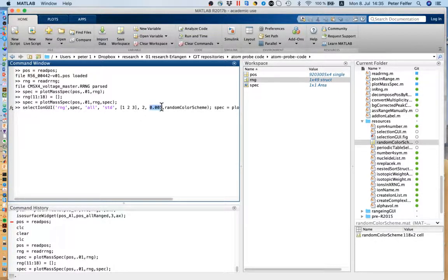The next thing is the abundance threshold. So above which abundance we think we will want to arrange the ions. You can make that 0, which means it takes all isotopic combinations of a given ion. But if the relative abundance is usually less than 0.5% or whatever, I just drop them. But you can make it 0 if you want.